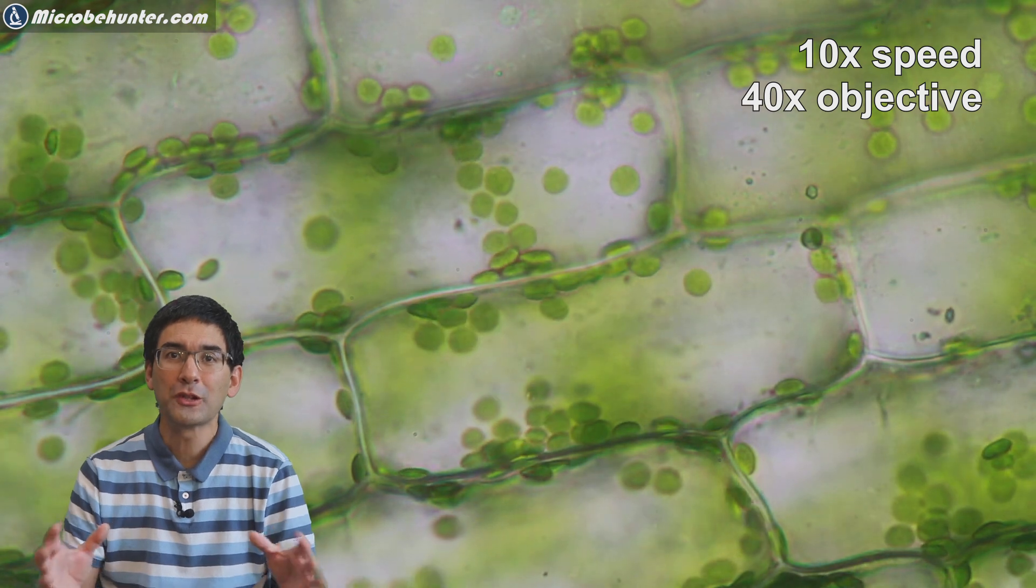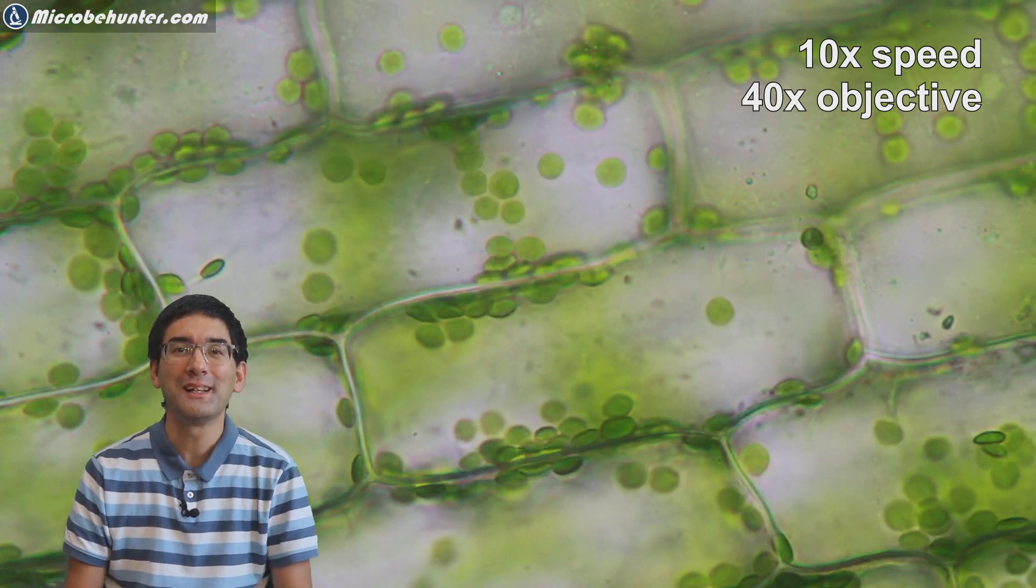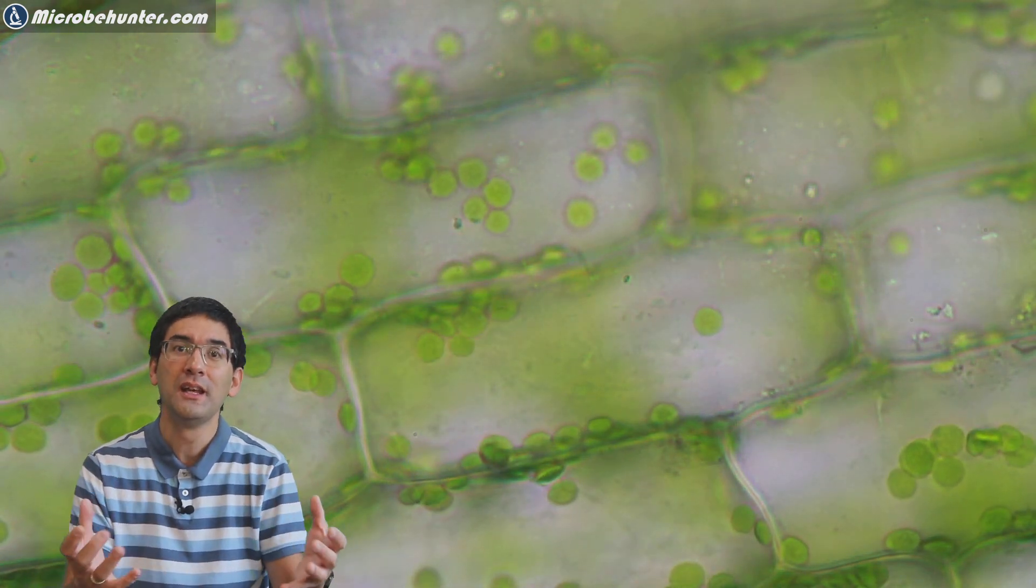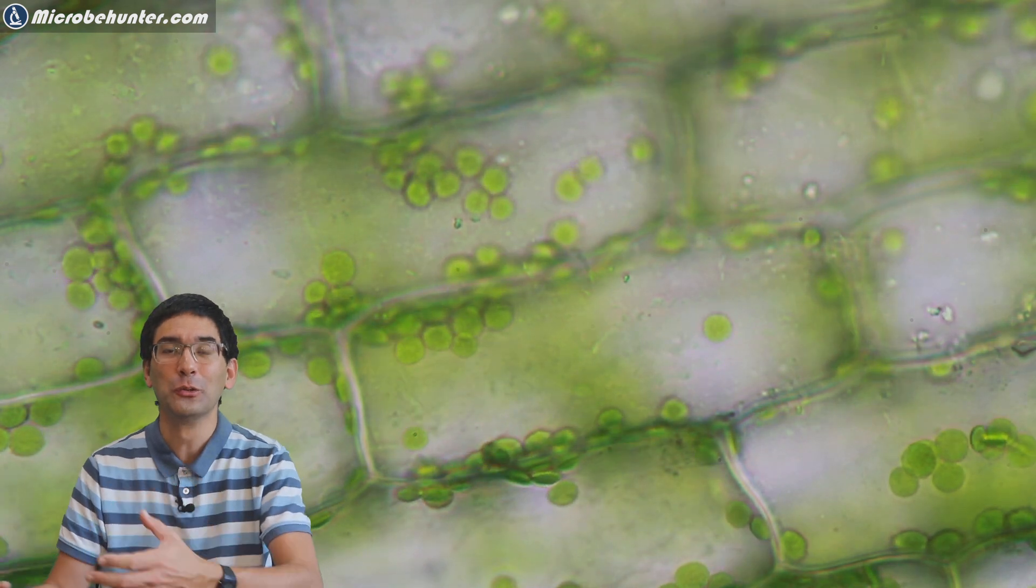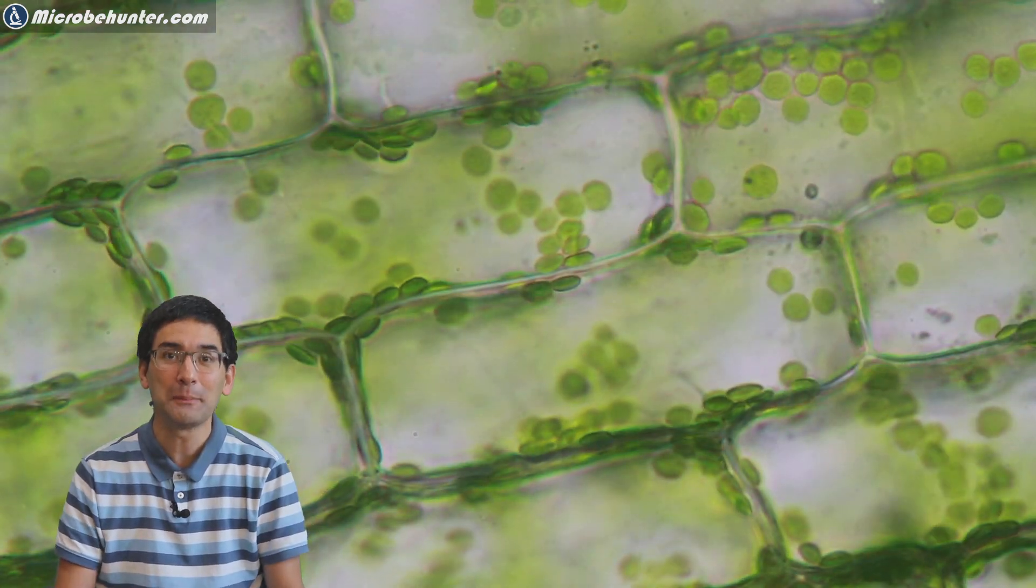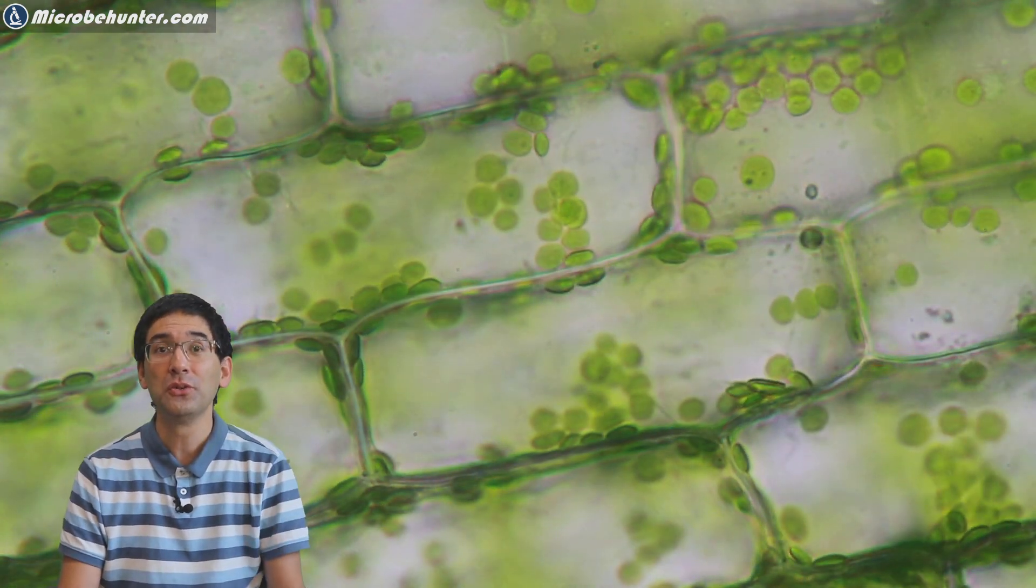And in this video, I'd like to show you how I've done that. So stay tuned. Those chloroplasts are cell organelles inside plant cells that do photosynthesis. This means that they catch sunlight and they use the energy of the sunlight to make glucose. And then the energy is stored in glucose. This is a very common thing that can be found not only in water plants, of course, but also in land plants.